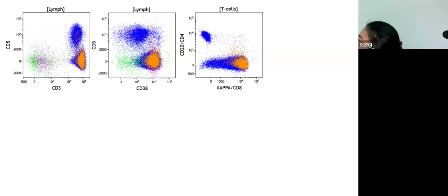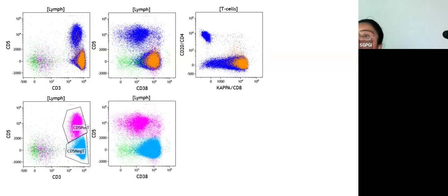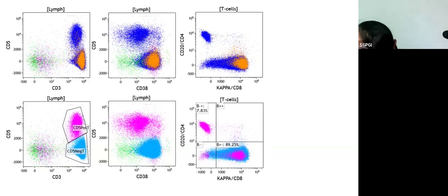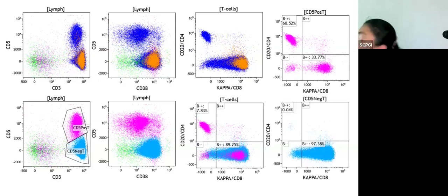When you look at CD4 and CD8, because these are T cells, what we actually see is that you have a lot of CD8 positivity that appears to be more than the CD4 positivity. If we color these CD5 positive and CD5 negative populations separately, we realize that among the CD5 positive populations, you have a nice split of CD4 and CD8, while the blue population appears to be positive only for CD8. The CD5 negative population has nearly 97% cells expressing CD8 at a heterogeneous intensity.